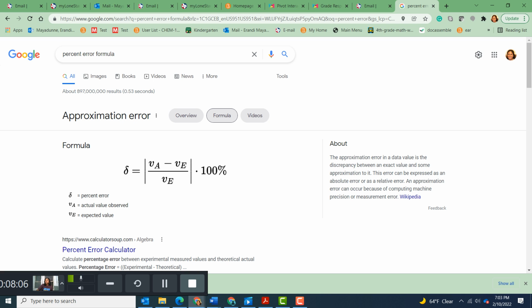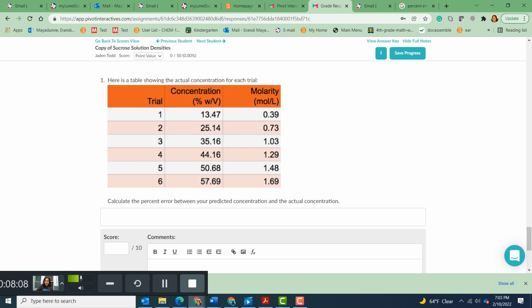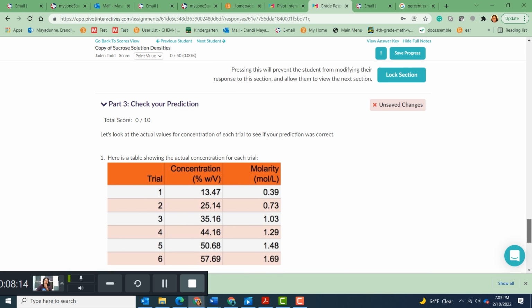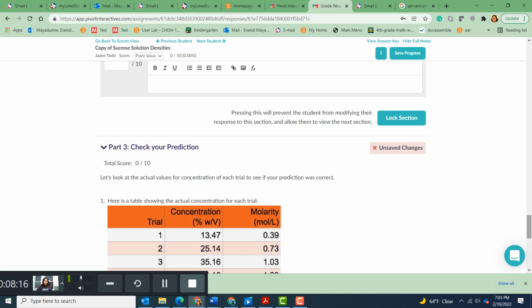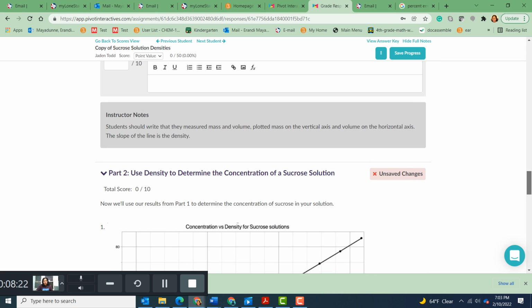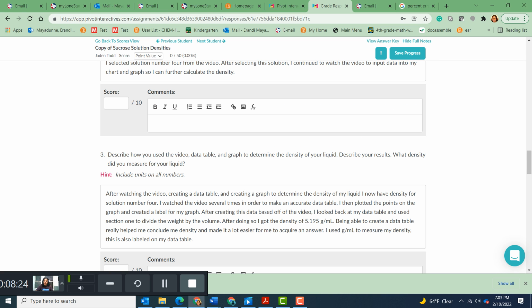That's the error I'm getting. So for this one, you can pick one solution and take your prediction. So I hope this will help you to understand the lab.